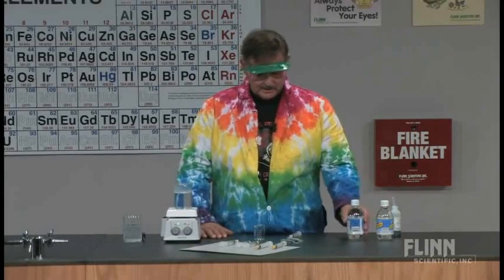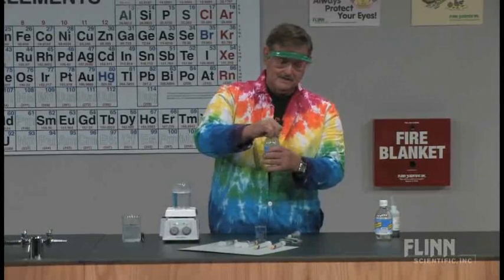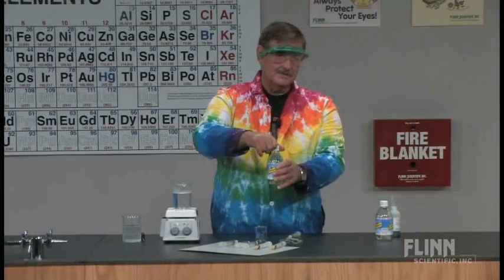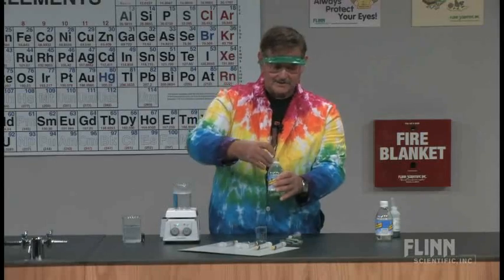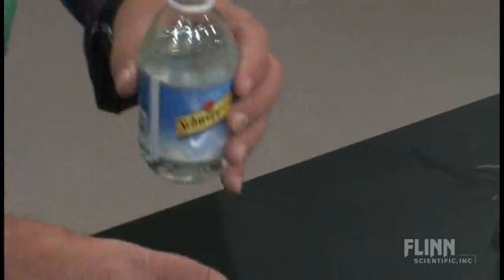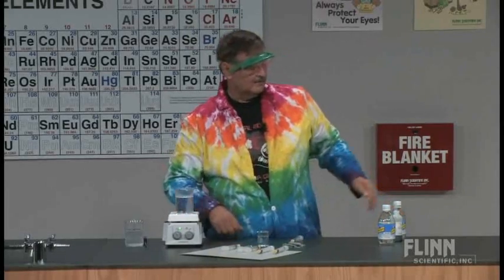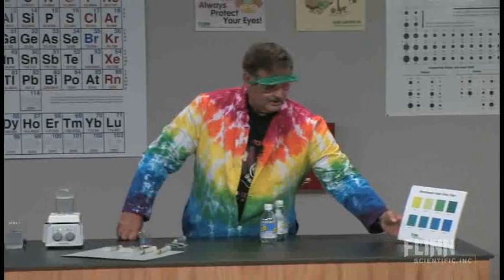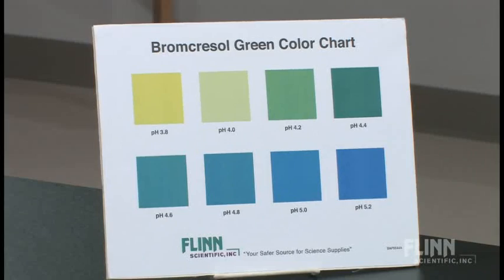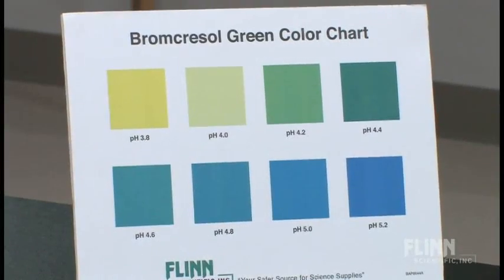What I'm going to do is pour some of the seltzer water into a small beaker. You have to be careful depending on what kind of seltzer you get because there's a lot of carbon dioxide dissolved in there - I've squirted myself in the face a few times. Then we're going to add an indicator called bromocresol green, which has, if we look at our chart, pH increments of 0.2, giving a nice color range from 3.8 all the way to 5.2.